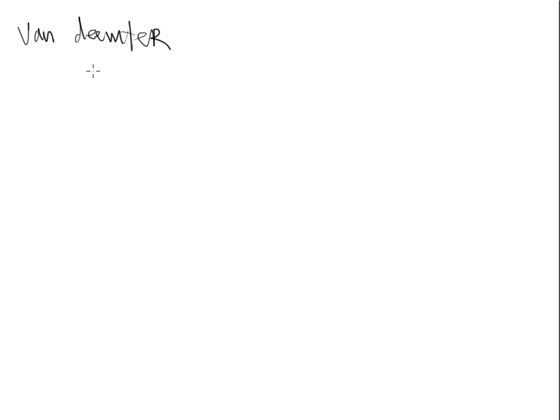Van Deemter. And we're not going to do a lot with the equation, but I just need to present it to you so that you've got a concept or a grasp of what the Van Deemter equation is actually all about. And we're going to talk about the variables that are inside of this equation and what they represent. But as far as actually plugging numbers in and calculating values, we're not going to do that because that's out of our pay grade.